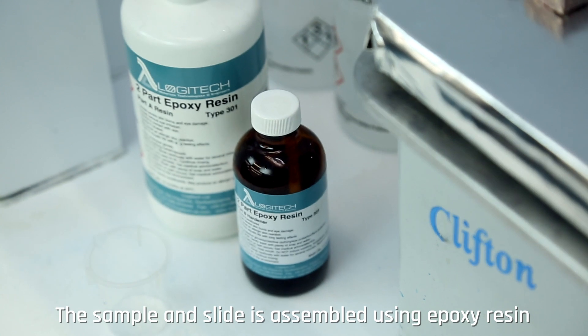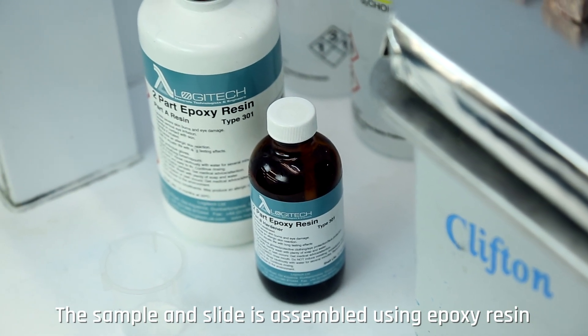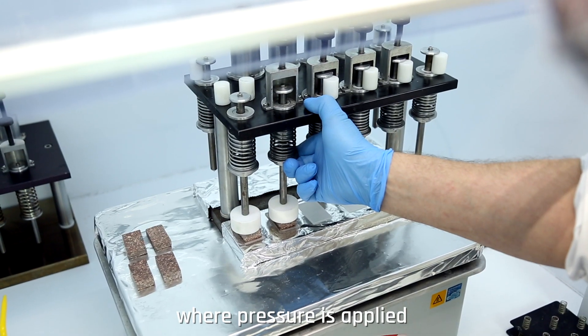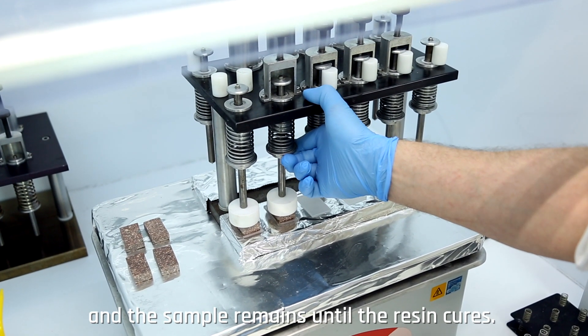The sample and slide is assembled using epoxy resin and is placed within the jig under a loading piston, where pressure is applied and the sample remains until the resin cures.